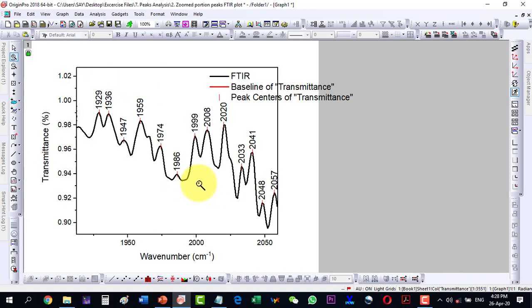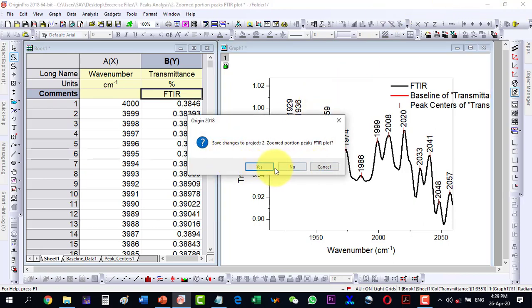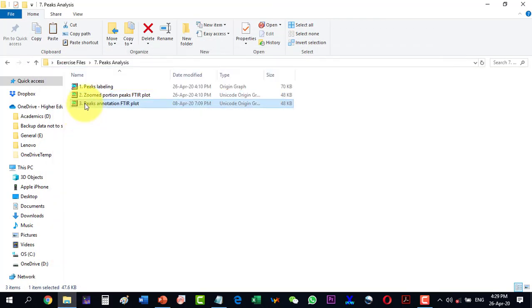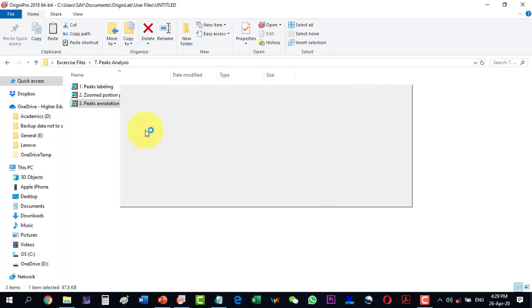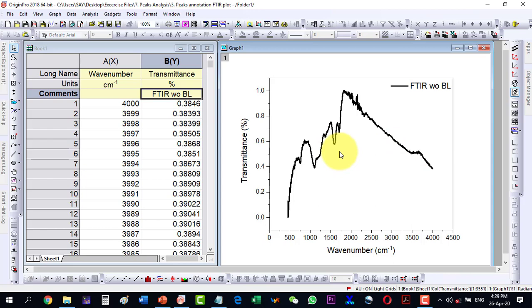For such a complex portion we would have to zoom in and find peaks, and it will find and label all the peaks automatically. But most of the time for FTIR we don't need that — the situation is that we need to find fewer, specific peaks. Automatic peak finding will find all peaks including those from oscillations, so one way is to smooth the data first. We are interested only in specific peaks and absorptions.